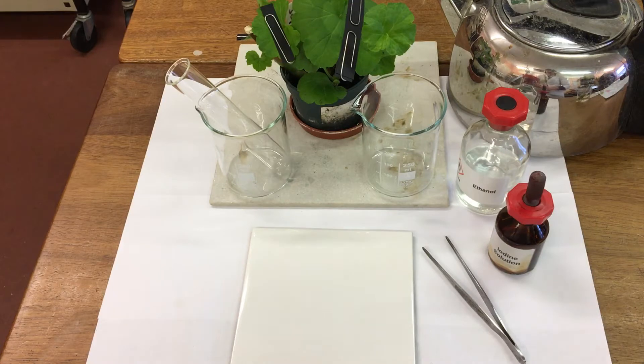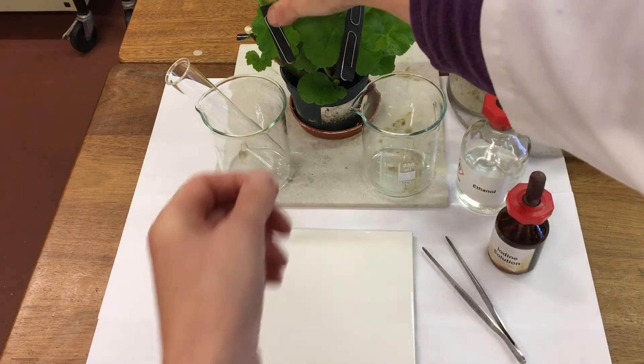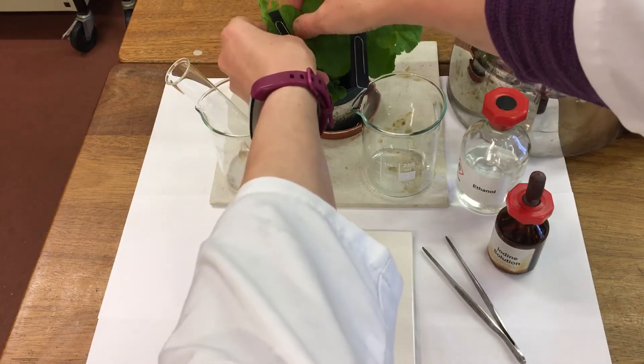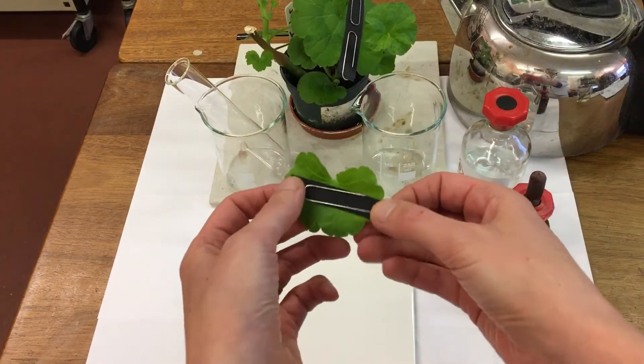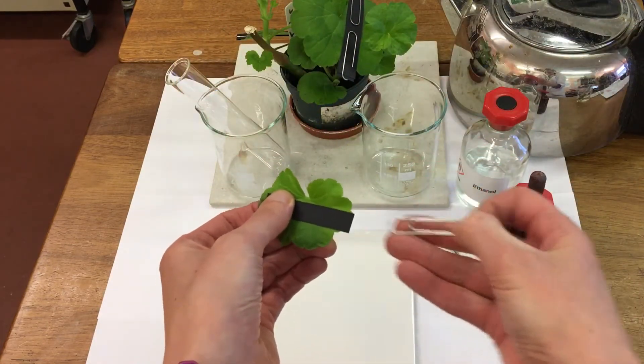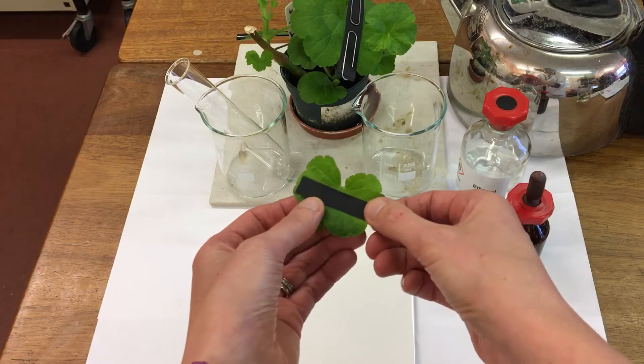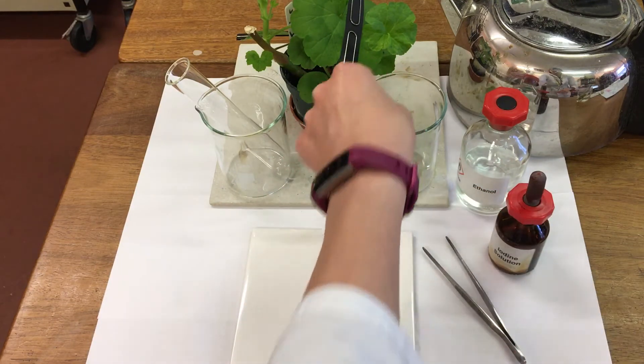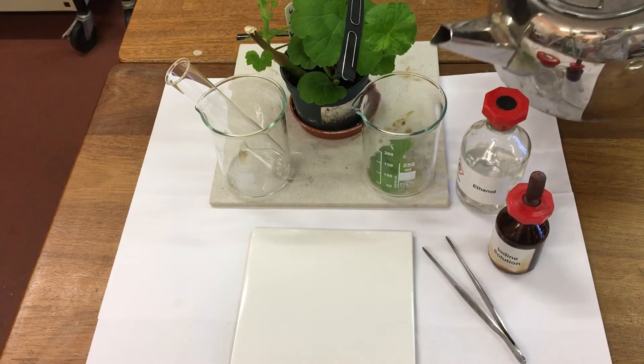So to test the leaf for starch, first of all we're going to take our leaf, we're going to remove the mask and pop it in some freshly boiled water.